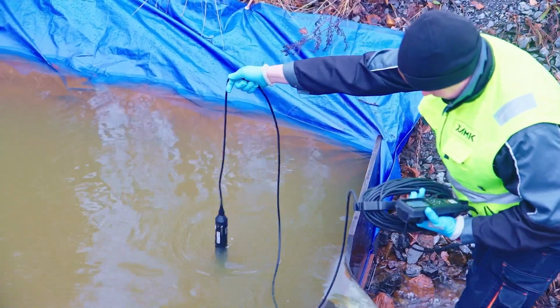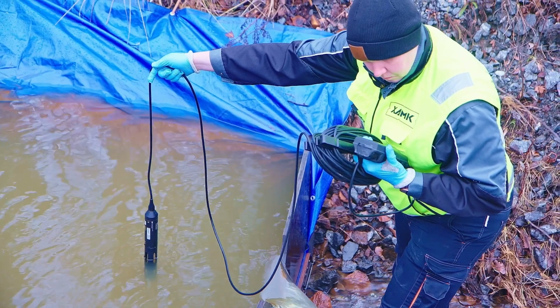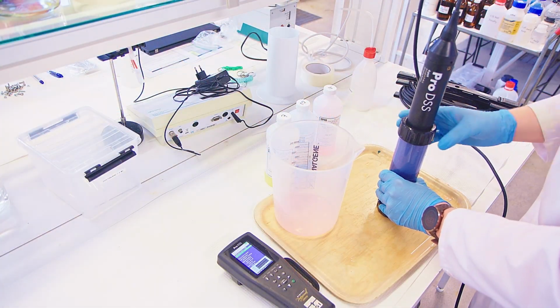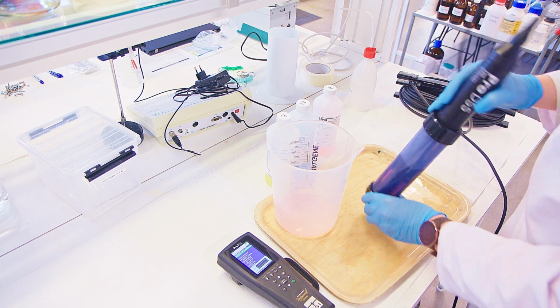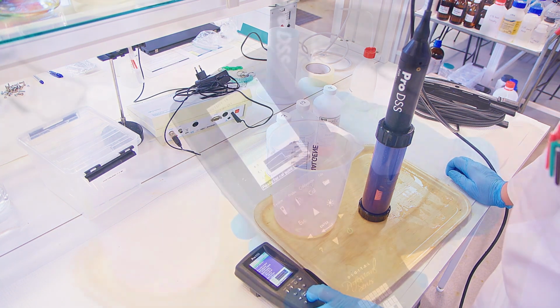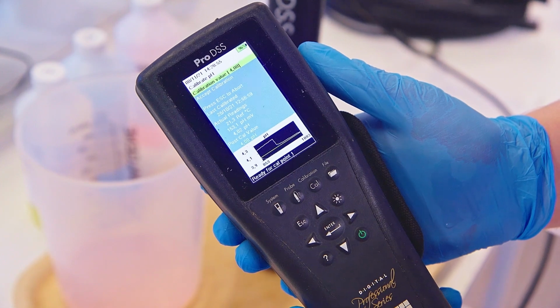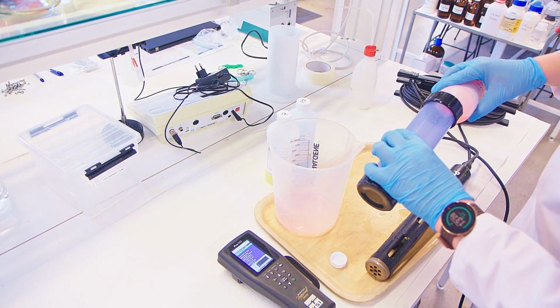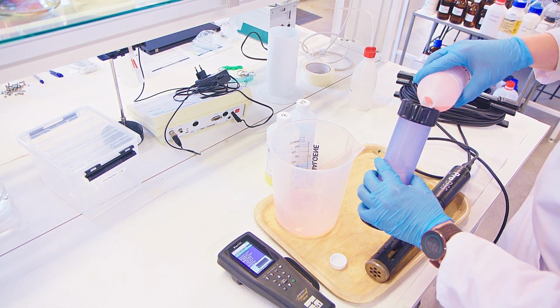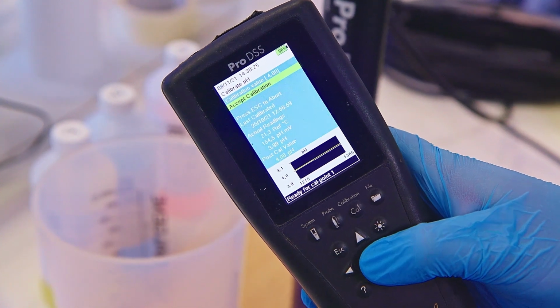The reliability of the measured results should be verified by calibrating and maintaining the meters regularly. Calibrations should also always be done for each individual measurement site. For example, calibration done in fresh water may not be suitable for measuring seawater. In addition, pH sensors may require even daily calibrations to obtain reliable results. The accuracy of the results should also be confirmed by taking periodical samples. The results of the meter should not differ significantly from the sampling results.